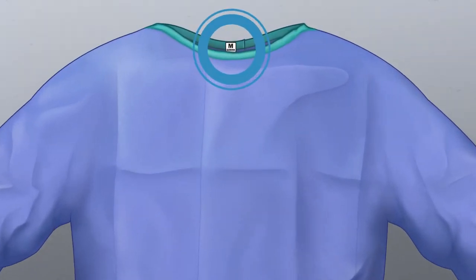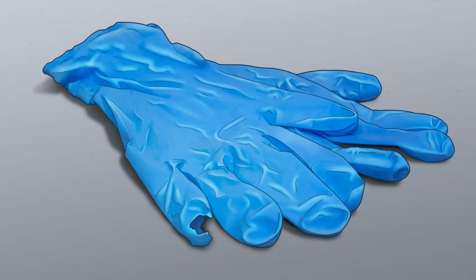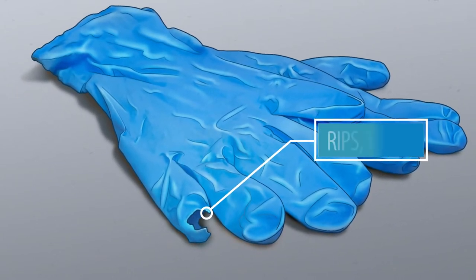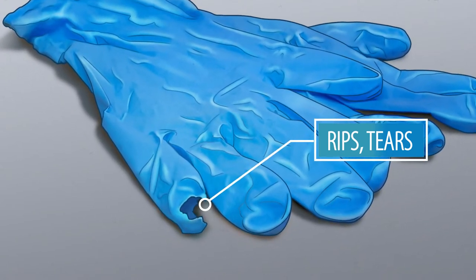Make sure you have the right size gown and gloves, and don't forget to visually inspect all of your PPE for rips, tears, loose or missing straps, and replace any defective PPE you find.